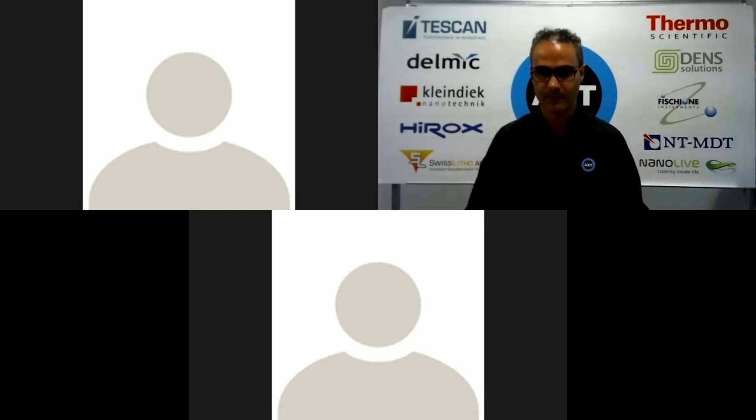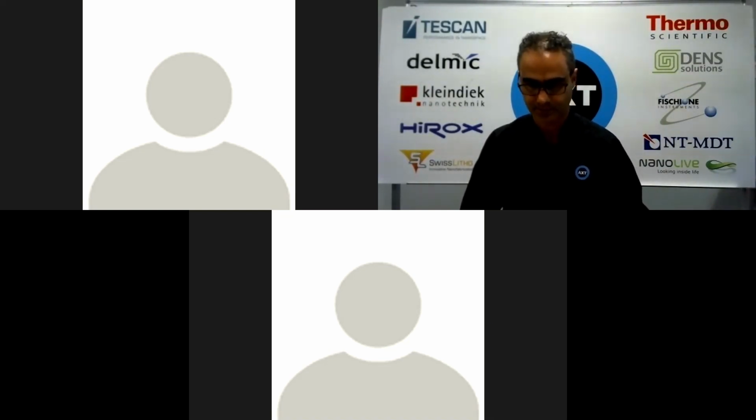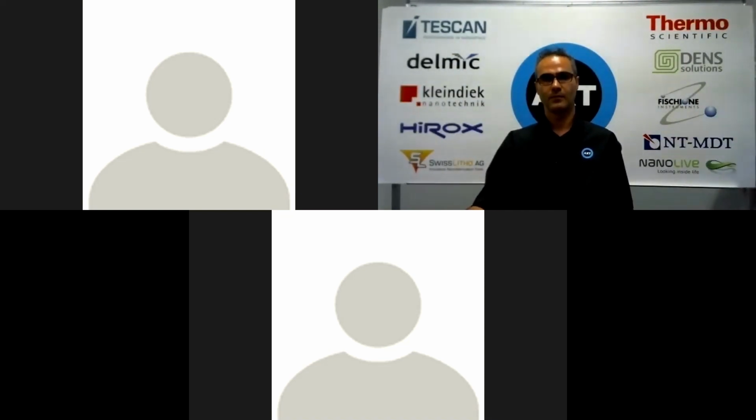It's potential to do it, and it's actually an interesting application. We can obviously do elemental analysis on labeled samples, similar to what they do in NanoSIMS, but NanoSIMS has a higher precision in the analysis of the specific labels. Although we can do it with gallium and even xenon, the high energy density tends to break most of the molecular bonds at the surface.